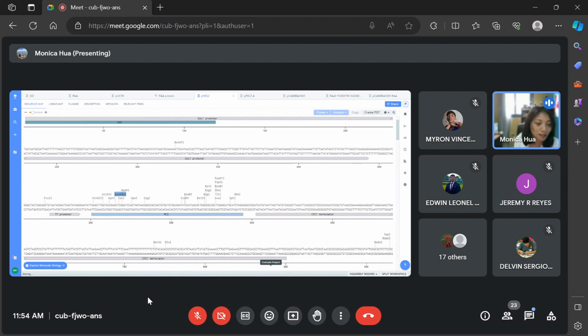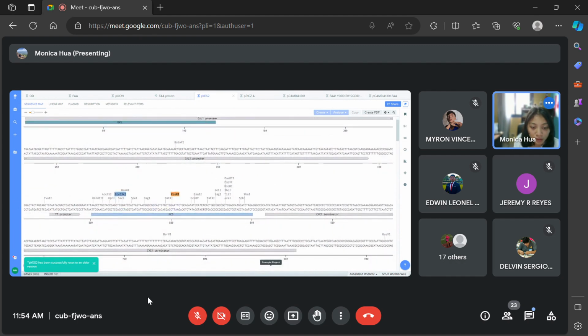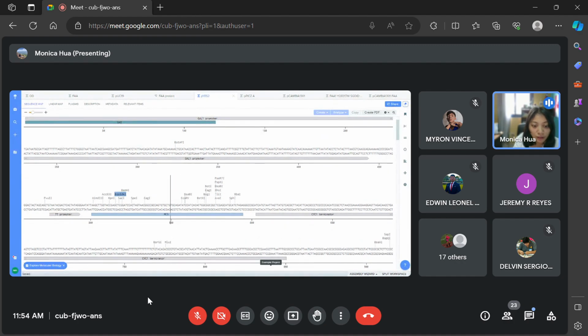This is freezing. Oops, it went weird. Okay, let me do it again. GAATTC. Okay, by 500, around 550. So delete that. Enter to delete. All right, there you go.